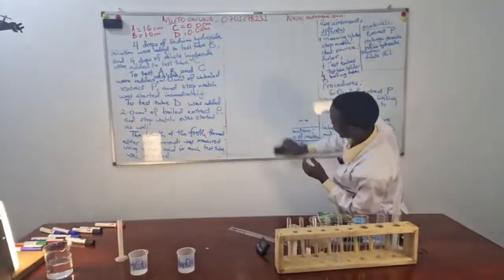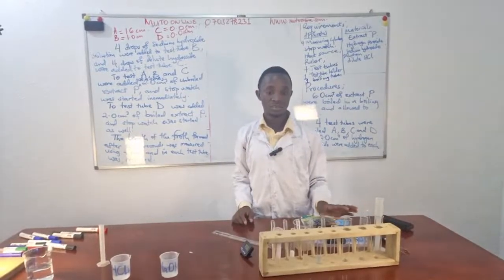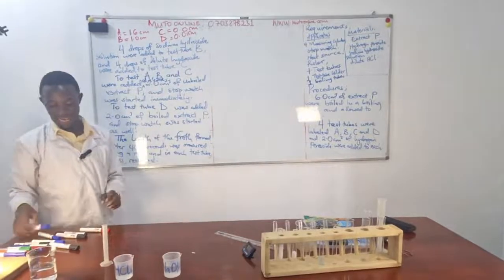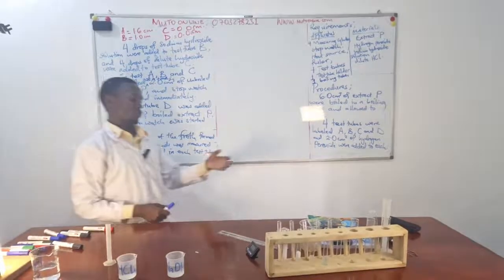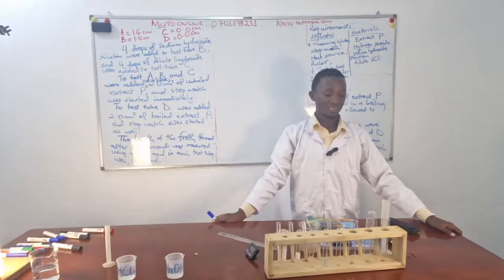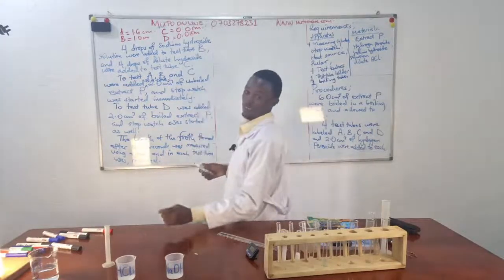I will not give you the risks and mitigation. We can develop the sources of error. Where do we expect errors? Where do we expect the risks? Which risks? Contact with the hot stove. You've seen me using a stove. You can put the risks and mitigation in the comment section. I'll go through them by the end of this.